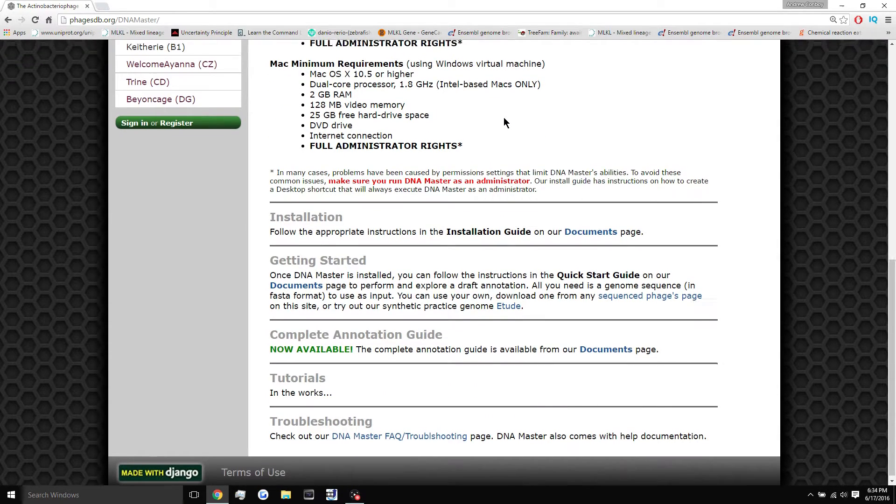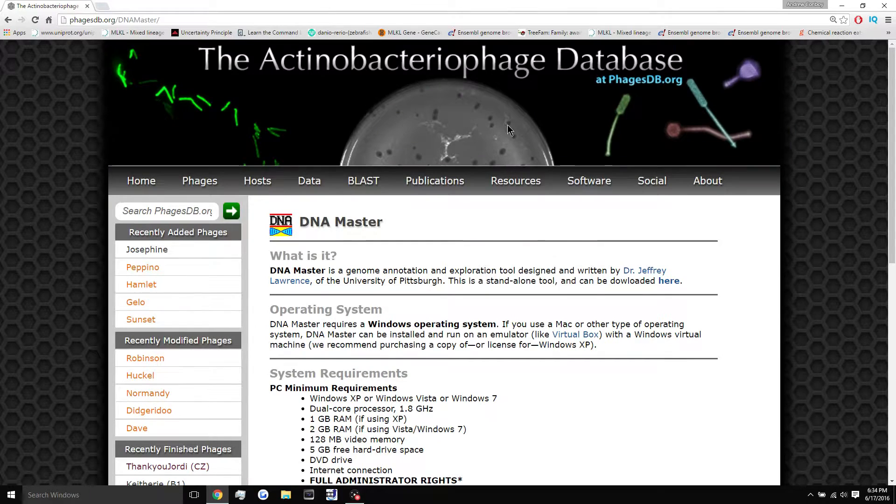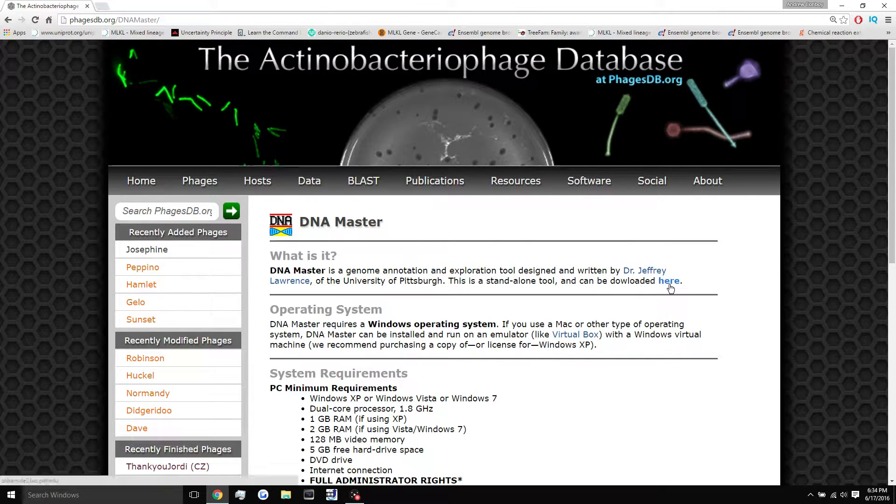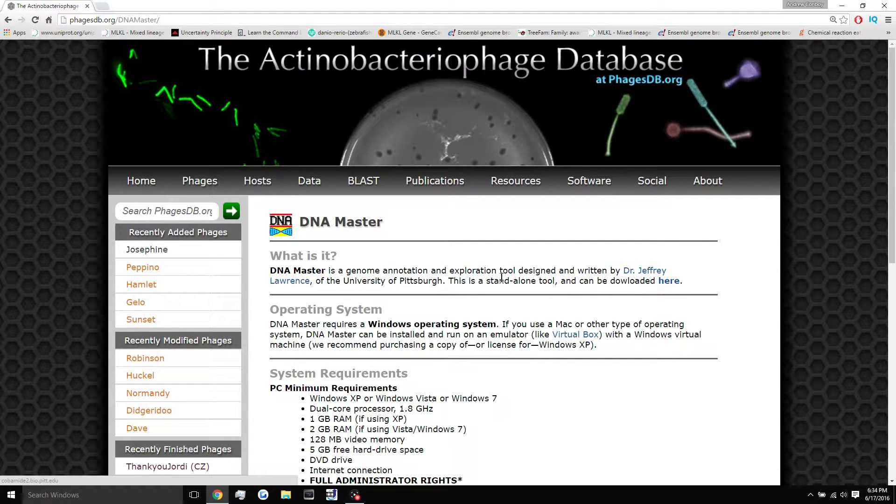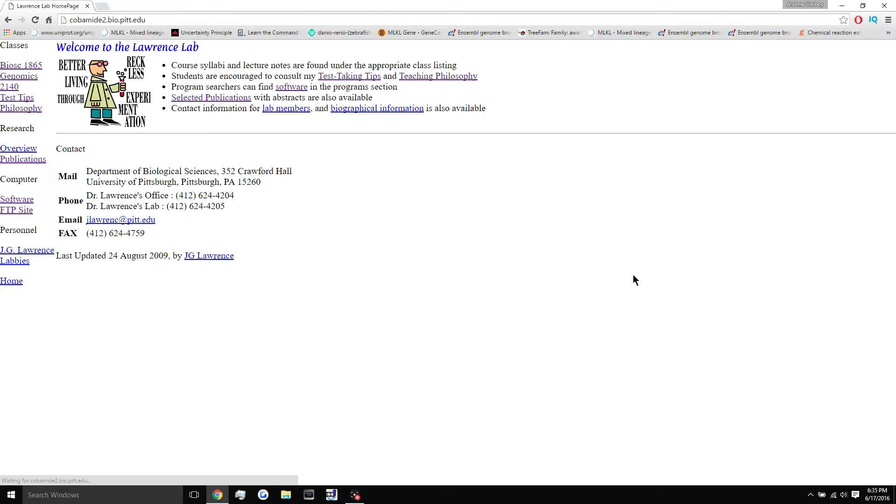All right, so what we're going to do now is just go and download this thing. So we're going to click this link that says this can be downloaded here. You're just going to click here. It's going to take you to his website.